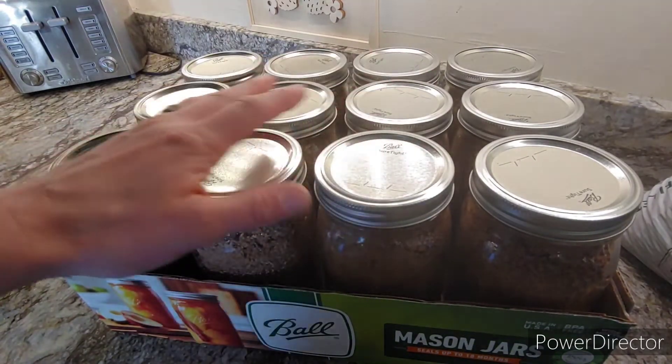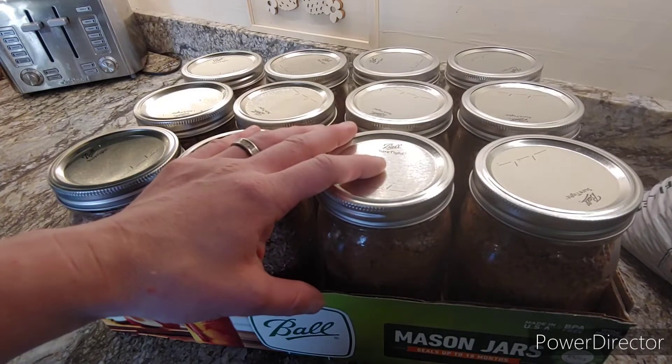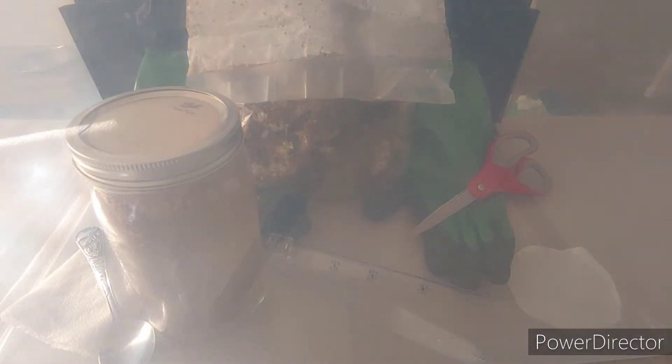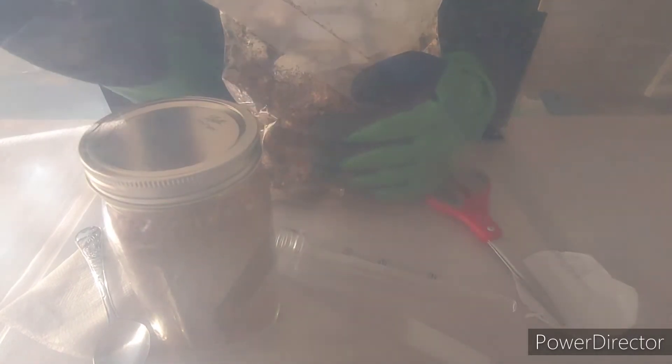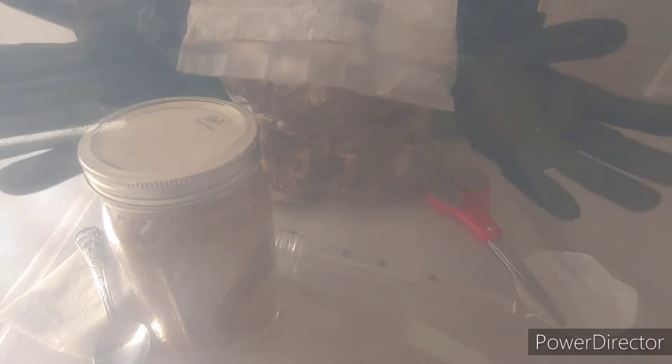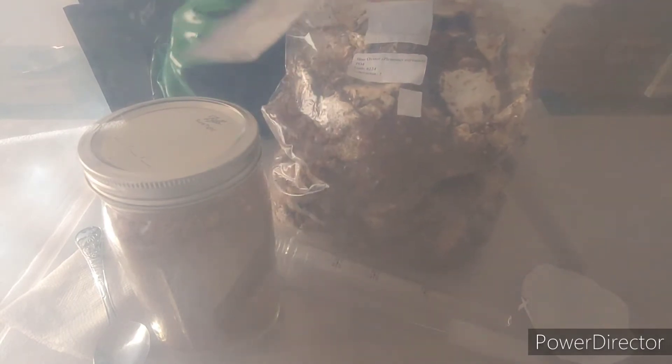So the next thing we're going to do is pop the lids off of these and inoculate our substrate with our spawn. What you have in front of you is my still air box. Do you need this in order to inoculate mushroom spawn? Not necessarily. Is it ideal? Yes. But even more ideal would be a flow hood.